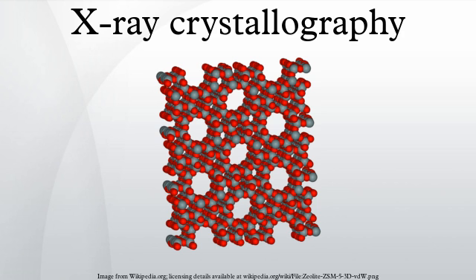Biological macromolecular crystallography. Crystal structures of proteins began to be solved in the late 1950s, beginning with the structure of sperm whale myoglobin by Sir John Cowdery Kendrew, for which he shared the Nobel Prize in Chemistry with Max Perutz in 1962. Since that success, over 86,817 X-ray crystal structures of proteins, nucleic acids and other biological molecules have been determined.